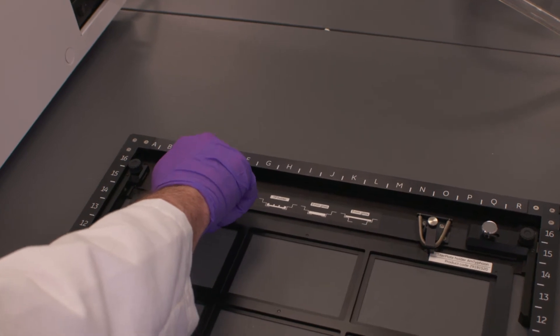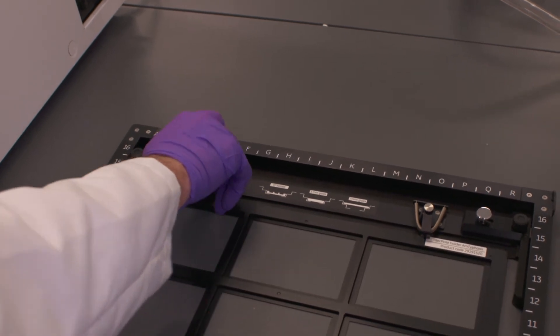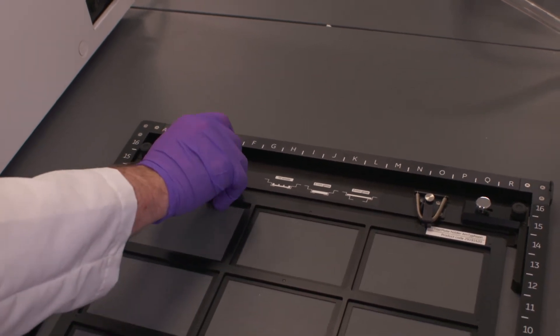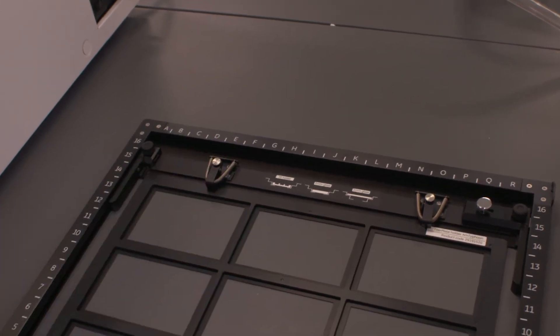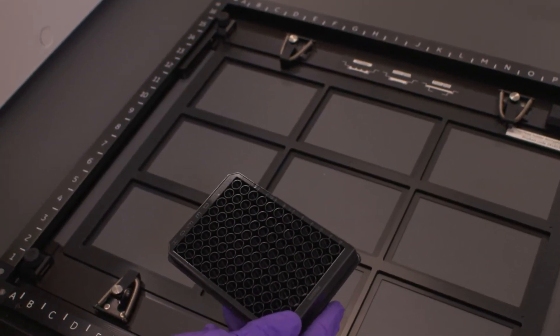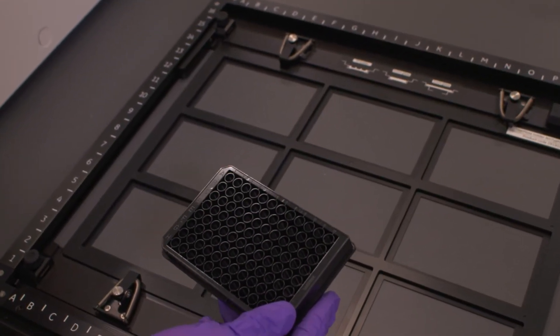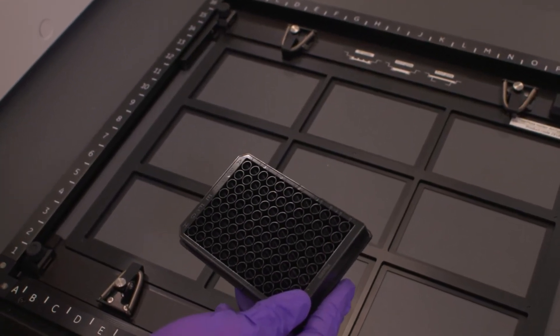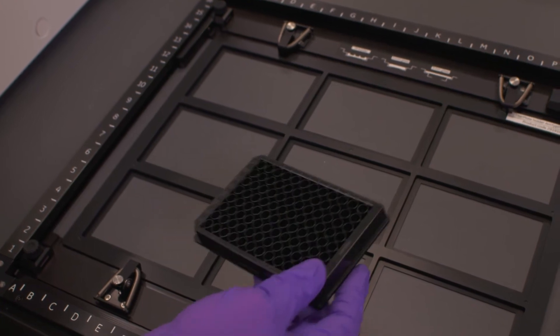Now we need our sample. In this case, we're working with a micro-titer plate. The micro-titer plate needs to have low fluorescent glass or plastic. It also needs to have a flat bottom rather than a round bottom.